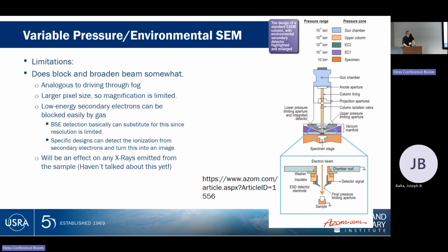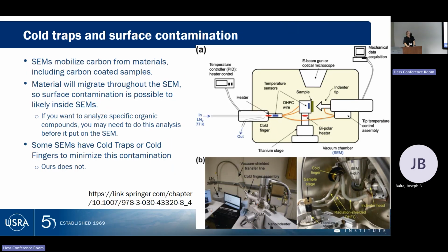There will also be an effect on X-rays emitted from the sample. No, we have not talked about X-rays yet.